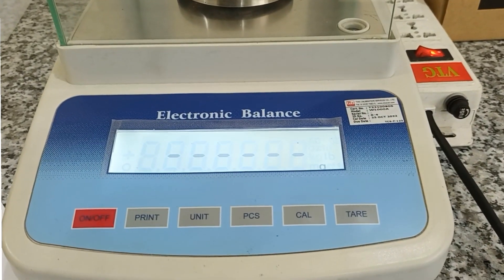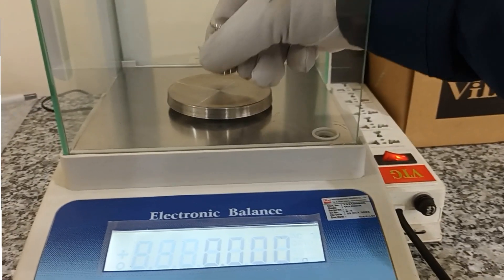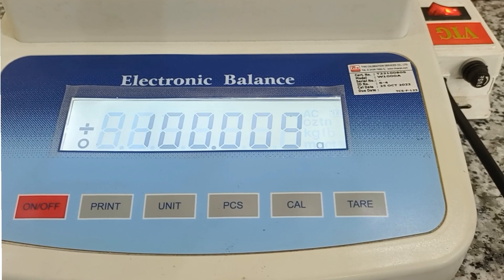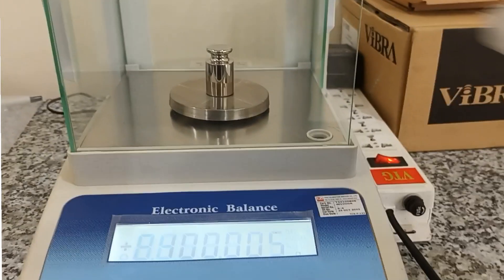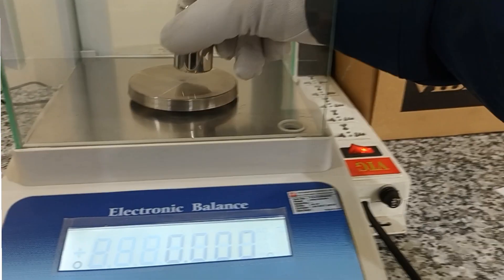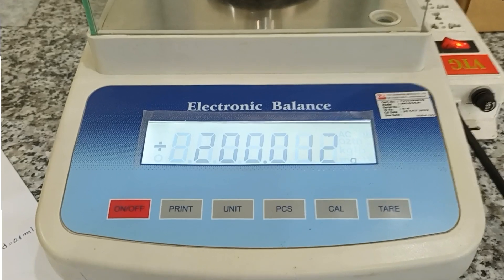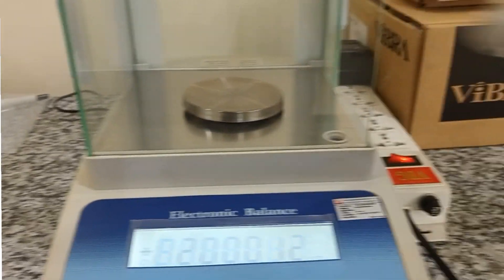Now I will check 100 grams — yes, that's okay. One more check: 200 grams — yes, it's okay.